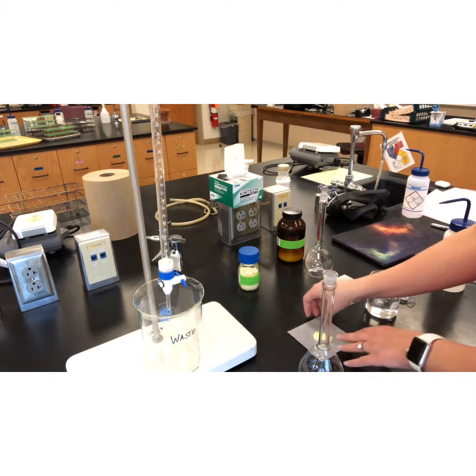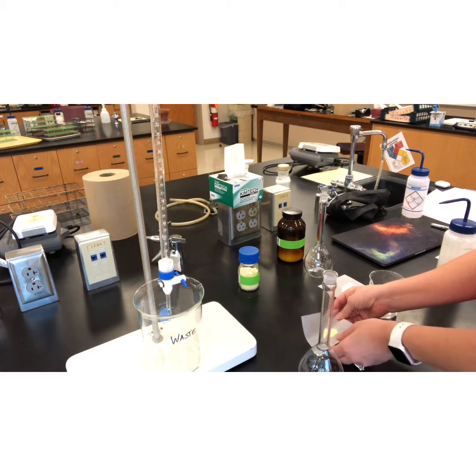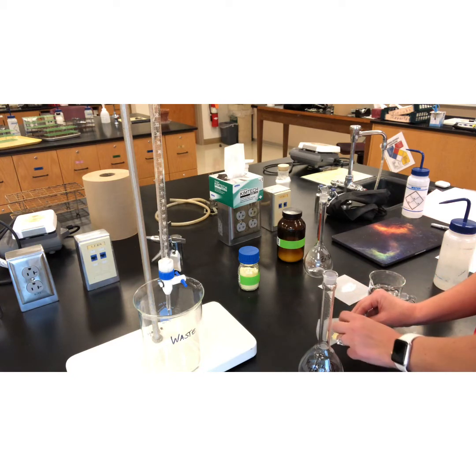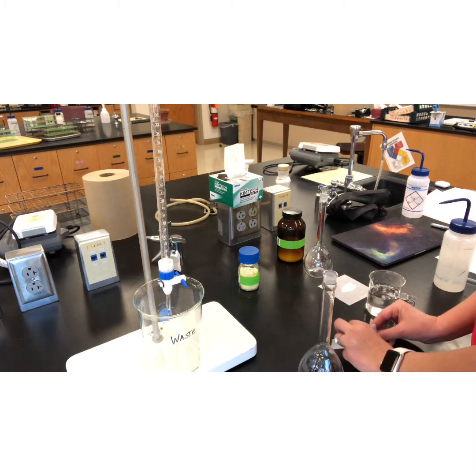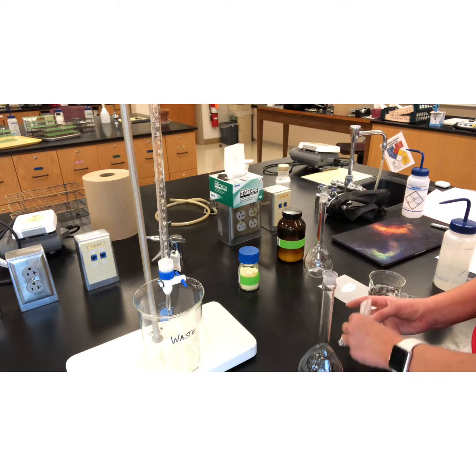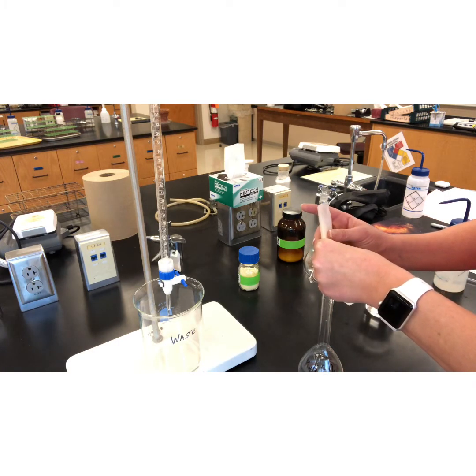I'm going to get that into my glassware. You could try a funnel, which probably wouldn't be a terrible idea, but I'm just going to use my weigh paper. I'm going to wrap it up like a little burrito. It's not wrapping the way I want it to. There we go. Go ahead and get all of that in there.